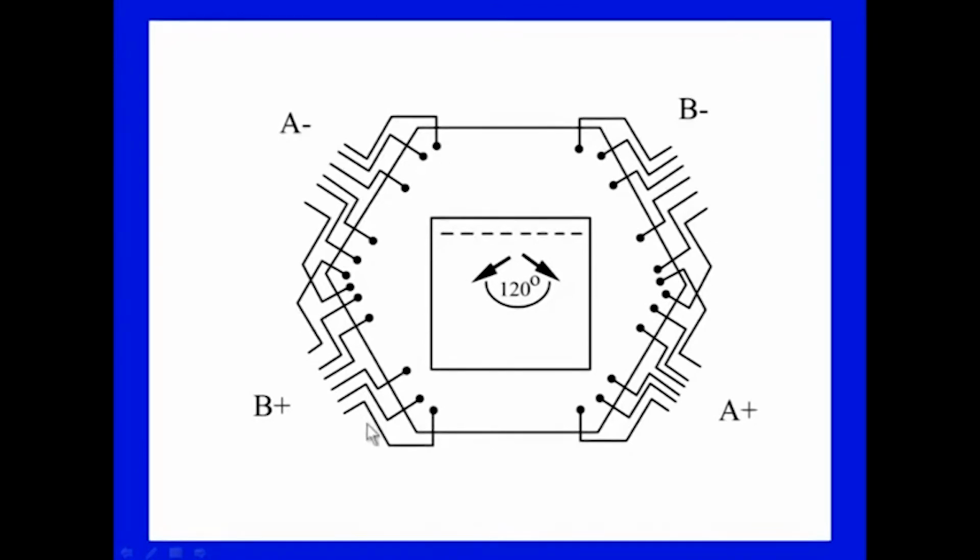This is a very common way. This is a hexagonal array of electrodes you can see. Here two directions are shown. The gel is placed in this electrode pattern, and the applied electric field is at 120 degrees here, like plus 60 and minus 60 directions, but the resultant movement is in a straight line.